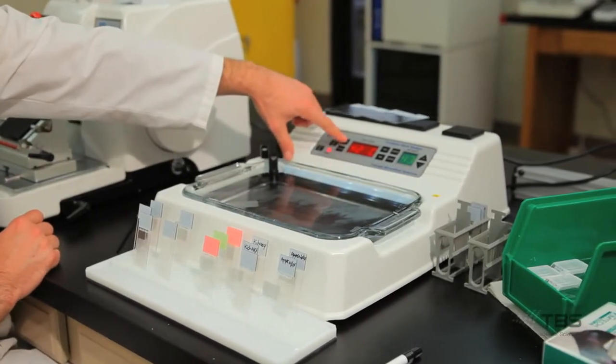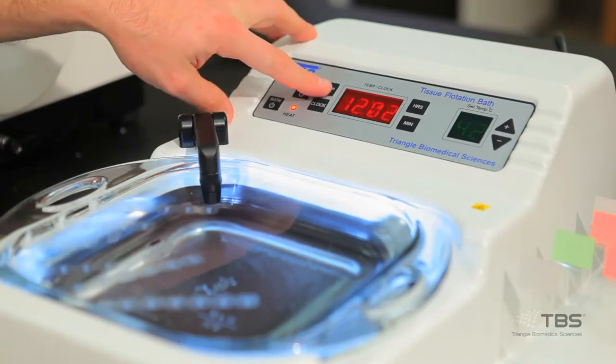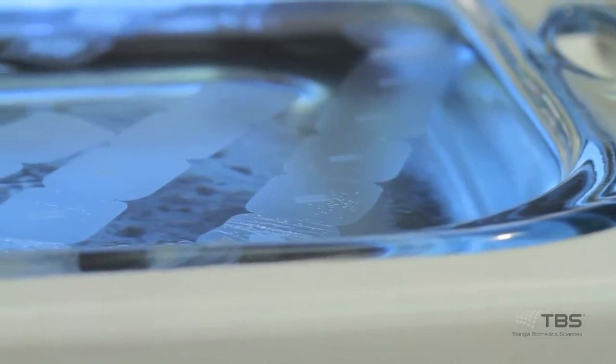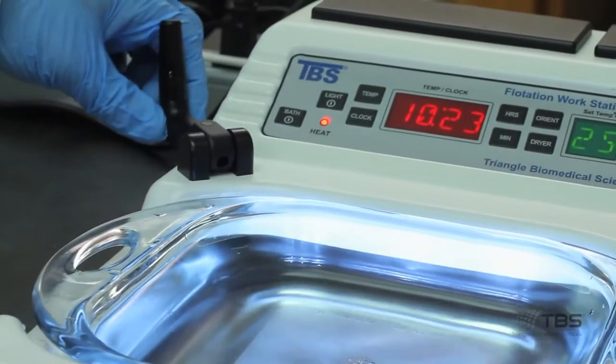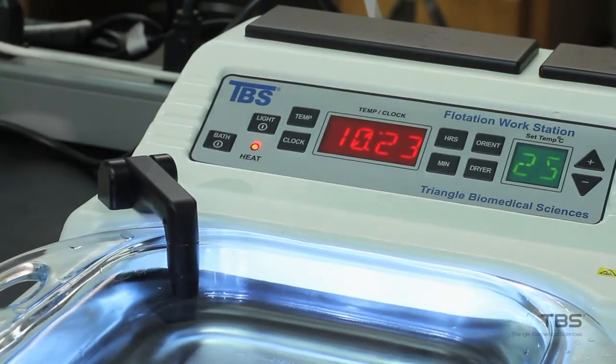All models are also low profile for user comfort. The LED lighting array is positioned to point away from the tech to reduce glare while attaching sections to slides. The non-mechanical temperature probe triggers the on and off function rather than mechanical switches utilized by competitors that are prone to failure.